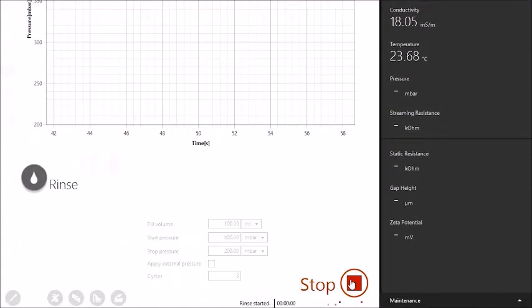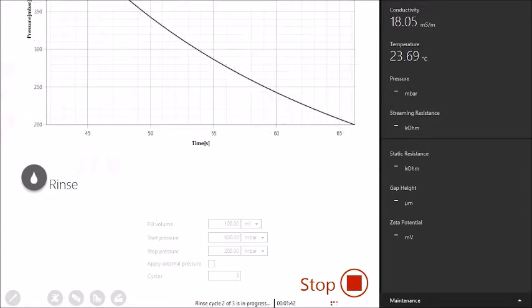Use the rinse cycle to adjust the gap between the sample and the reference film, while filling the cell with measuring liquid.